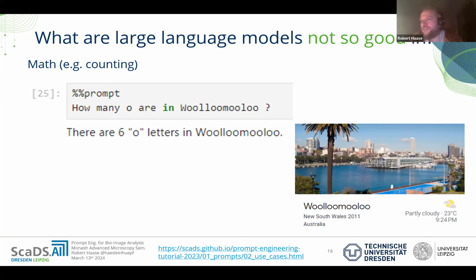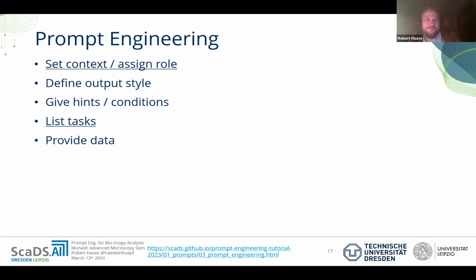So now imagine instead of putting text in, where the information is quite simple in structure, imagine you take this technology to put a microscope image in and you ask for how many nuclei are there. That's extremely challenging. That's extremely complicated. Language models may not be for this kind of task. So they may never be developed to a degree where they can solve these kinds of problems. There's other models which are much better in this. So that's why I have it here on my list.